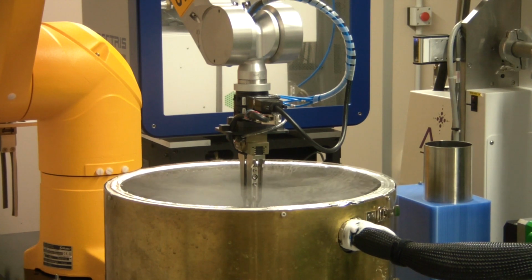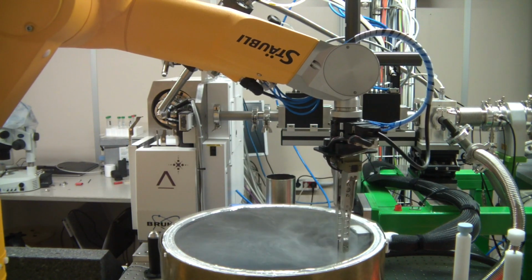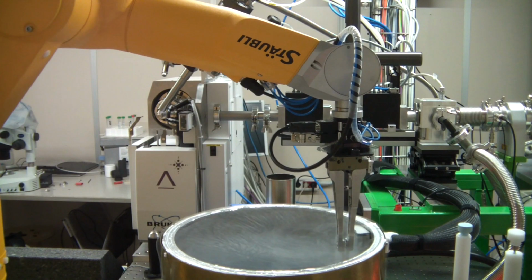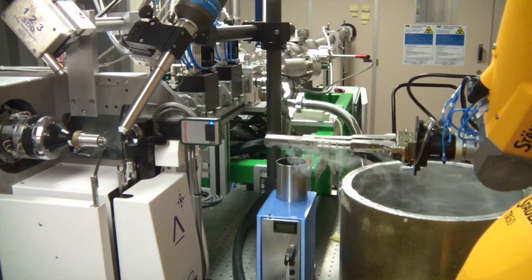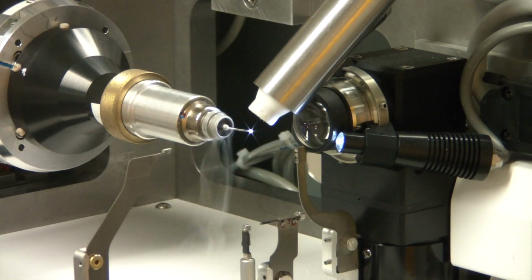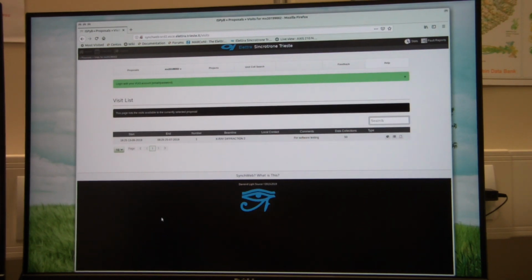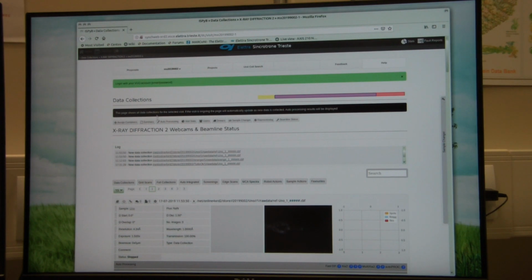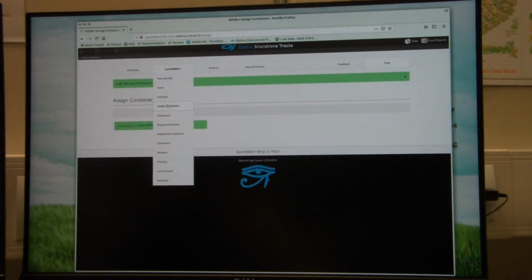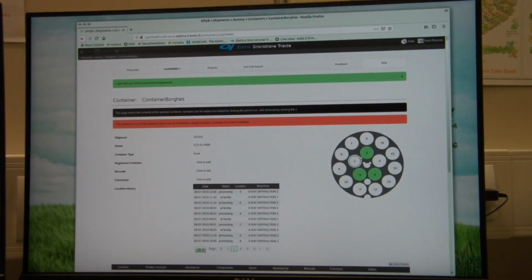We can accommodate several pucks with our robot, the sample changer, and it's easy to configure what goes in and out with all the software that you can access from home. Once you arrive at the Beamline, we can just upload everything into the data collection software. All the software to collect and access the data is done remotely through the web interface, and we also have very quick access to download the data from home. So people can be here collecting data, and other members of the group at their institution can download the data and process it.